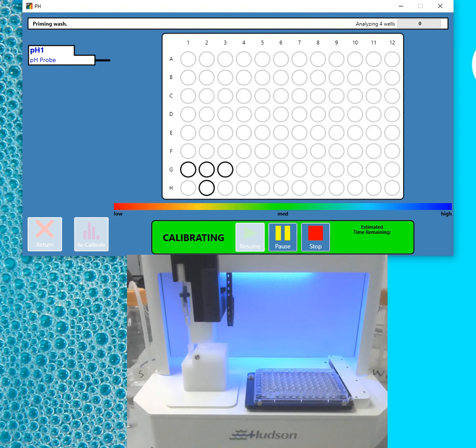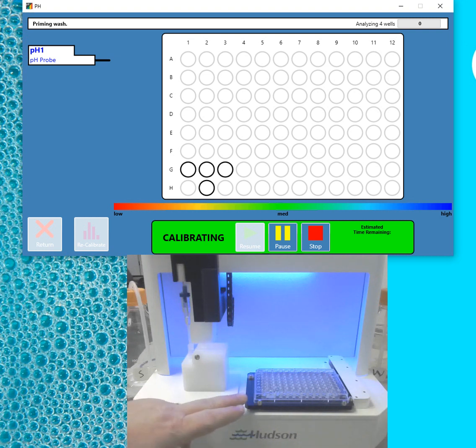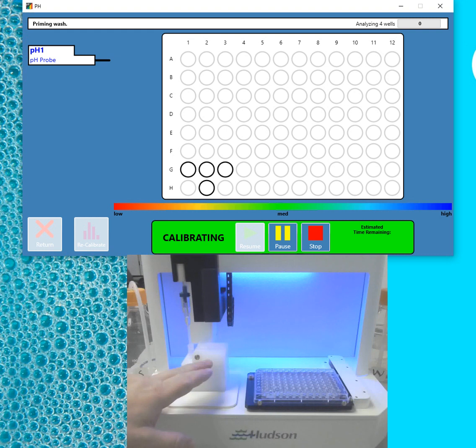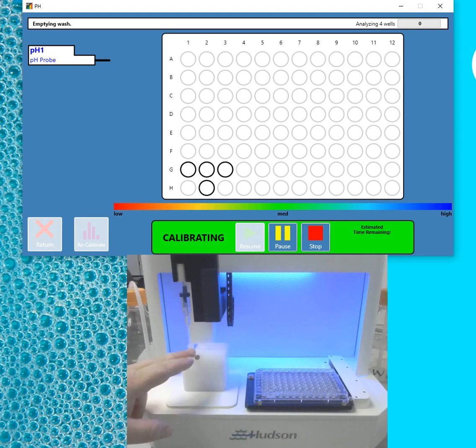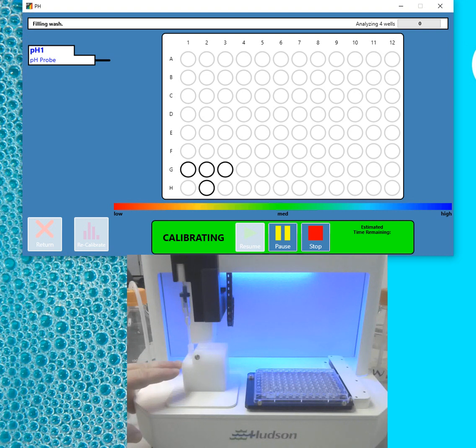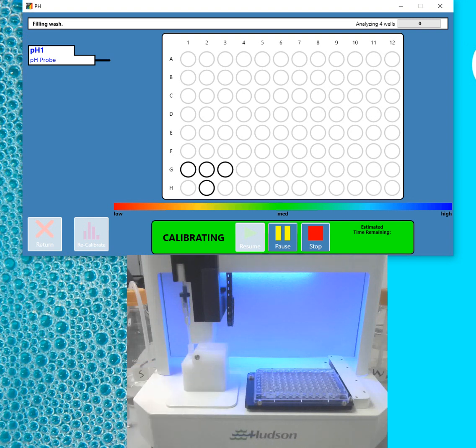So while the deionized water is being loaded into the wash station, I'm going to point out where the components on the Rapid pH are. You have your microplate nest. You have your well for deionized water, which empties and refills between each sample. You have a blow-drying station. And you have your storage buffer well. Currently I have KCL in it. But you could also use pH 4 or pH 7, whatever you're currently using.